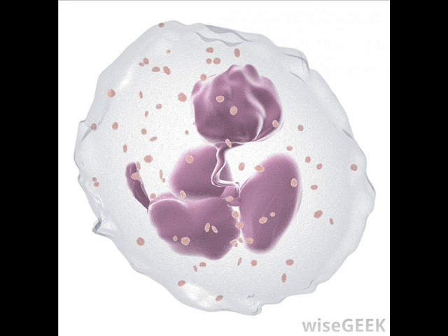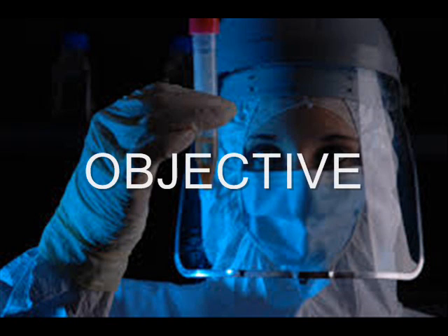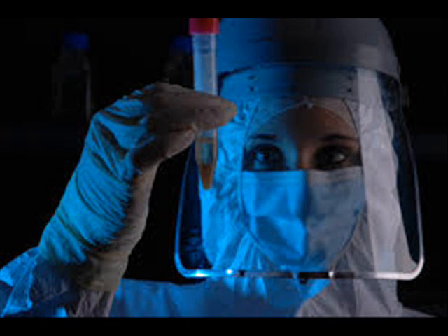The objective of this laboratory is to isolate the DNA from a blood sample. By this, we mean that we separate the red blood cells from the white blood cells, because the white blood cells carry the information. So we conclude that they carry the DNA, so they are the ones we are focusing on and interested in. To do this, we made several chemical procedures that are later going to be explained and used.